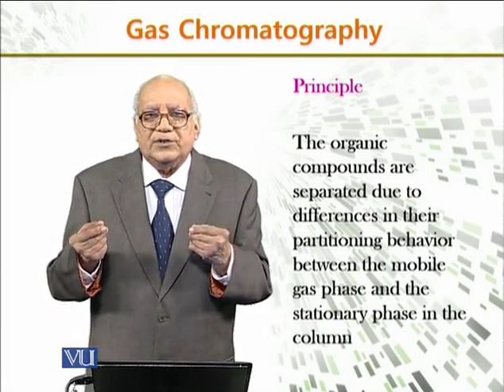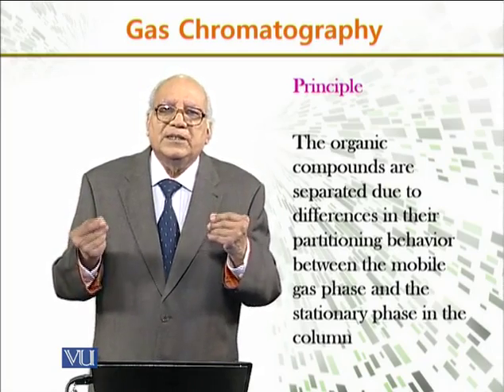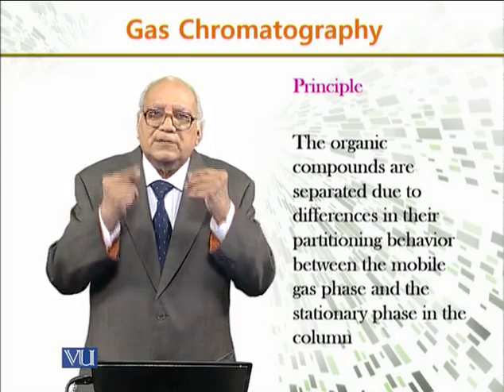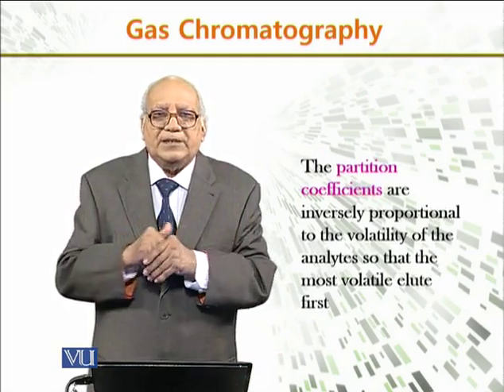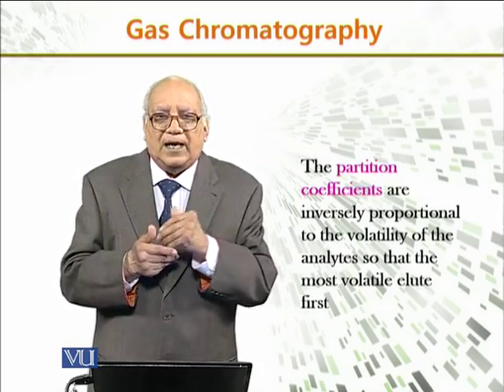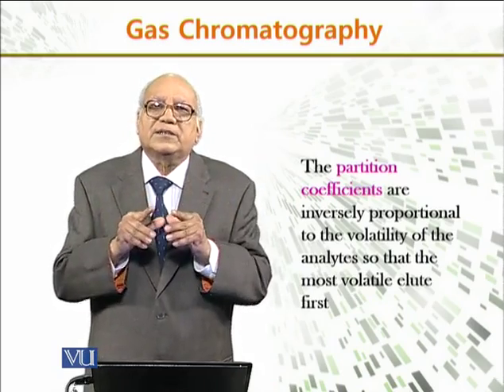So in this case, the partitioning behavior of various compounds is a major identification factor for those molecules. Now, the partition coefficients are inversely proportional to the volatility of the analyte, so the most volatile elute first.